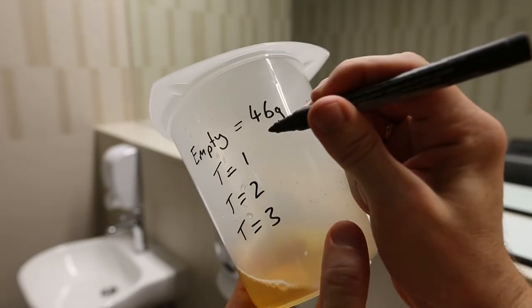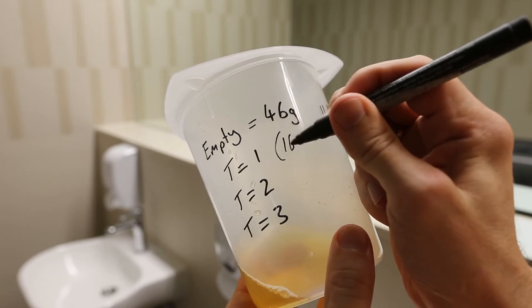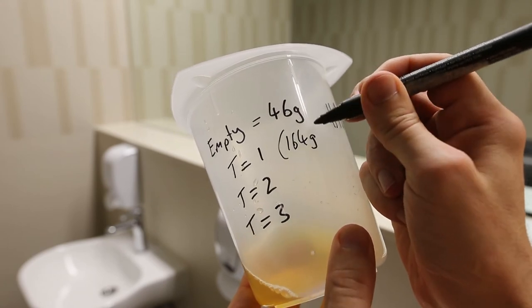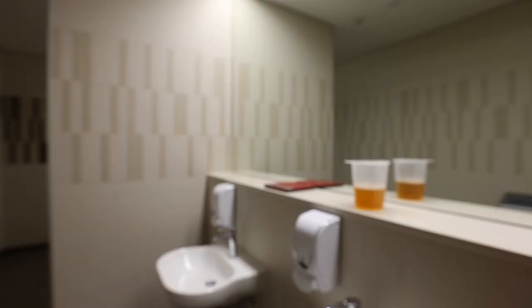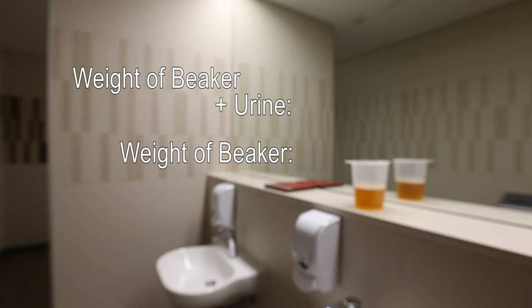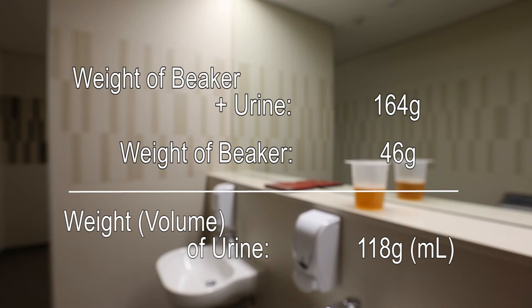Since aqueous solutions have approximately the same density as water, that is, 1 gram per ml, we can use the weight of the urine in order to accurately measure its volume. In this example, the beaker plus urine weighed 164 grams. The empty beaker weighed 46 grams. So therefore, the weight of the urine was 118 grams. In other words, we have 118 ml of urine.